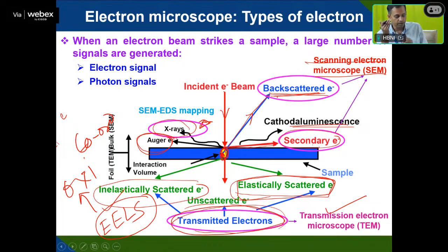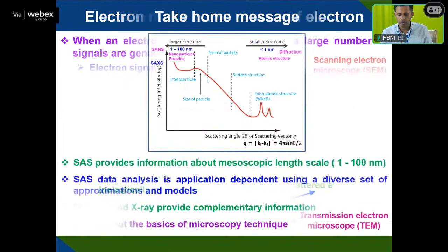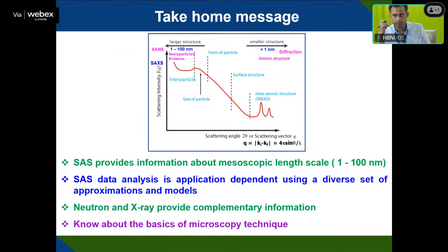like the absorption techniques, XANES and EXAFS. Similarly, in electron energy loss spectroscopy, using ELNES and the extended technique, you can find out oxidation state and coordination number. We'll discuss all those things in the scanning electron microscopy study and transmission electron microscopy study, as well as XPS, or photoelectron spectroscopy.